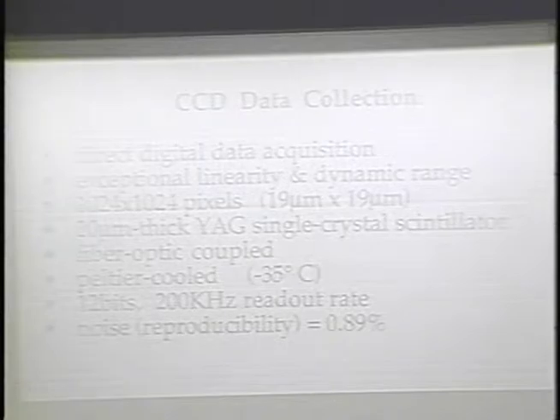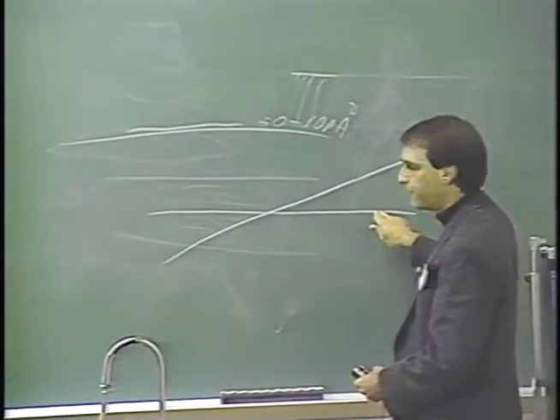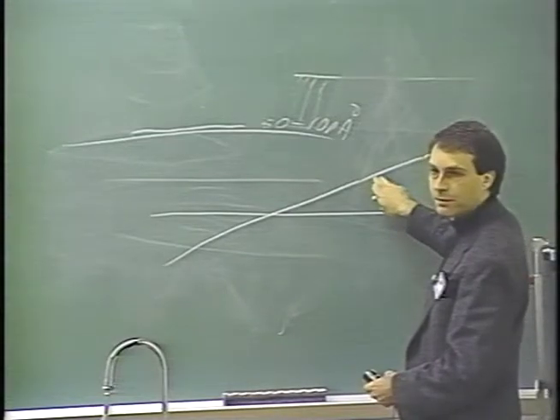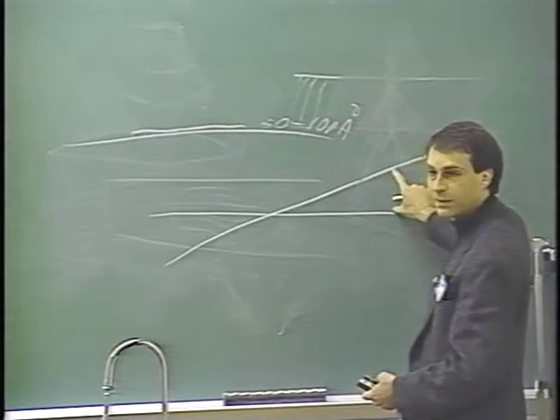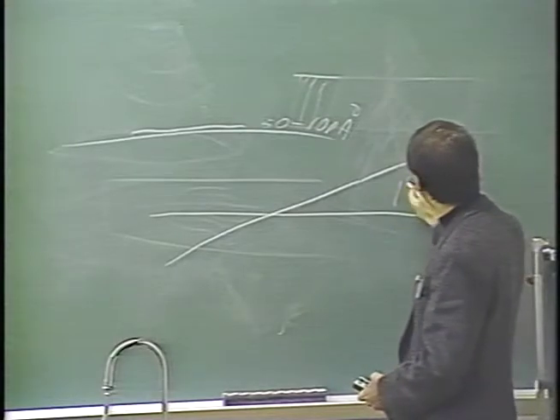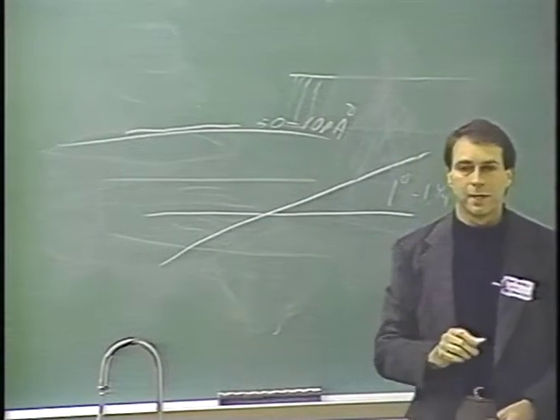In the tomographic process, the three-dimensional data is developed by effectively looking at the differences between a view of the image at one angle and a view of the specimen at another angle. As you'll see, to get to high resolution, we need to take many, many views, which means this difference in tilt becomes very small. Typically, we use values of around 1 to 1.25 degrees.